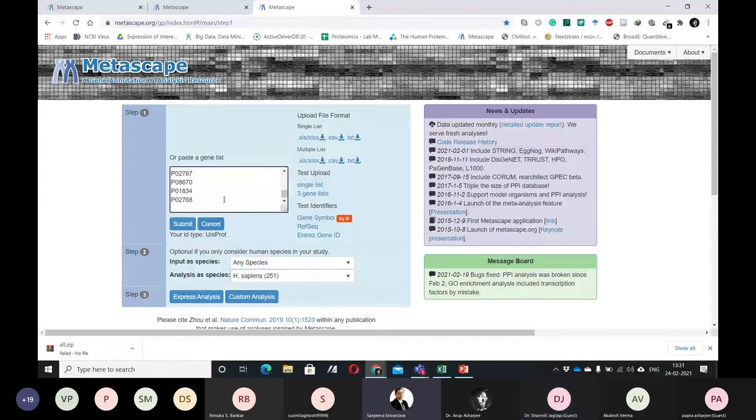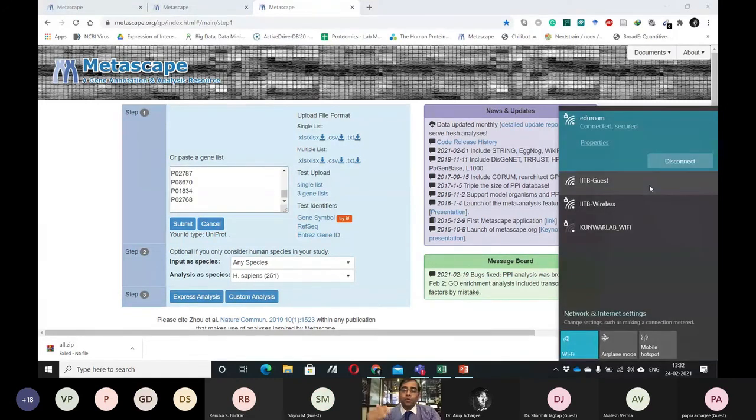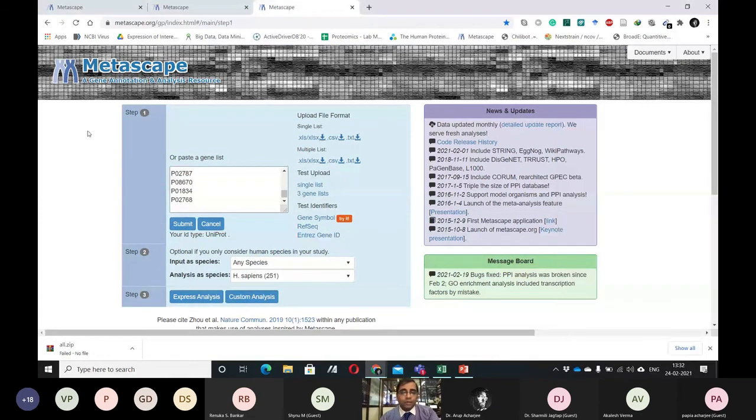But the list of genes one could always select as per your discretion as well. Either you can go with the cutoff of four, anything above 2 or 4, up and down, and also the p-value passed. Even one could do analysis from that. So please go ahead now.